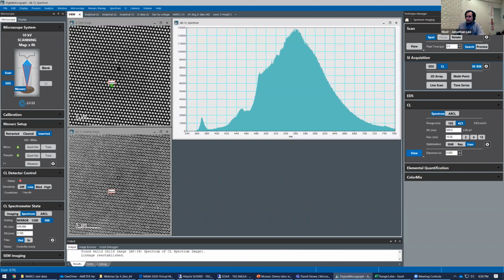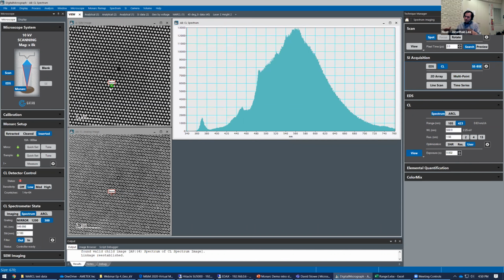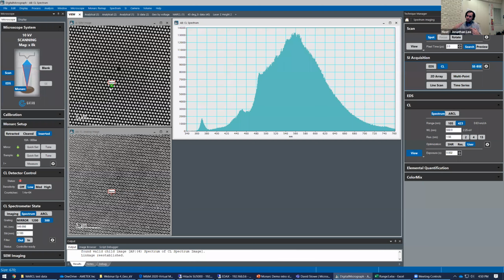It looks a little bit different, but that's a natural thing to happen because we've improved the spectral resolution. There's less overlap from light that's coupling in at more oblique angles. It may be off axis, not quite collimated, because the entrance slit did not reject it when it was wide. Now that it's narrowed, we get a much more accurate spectrum.